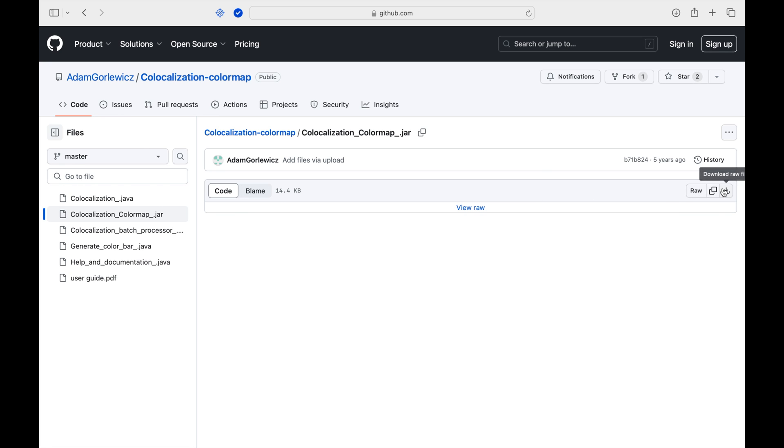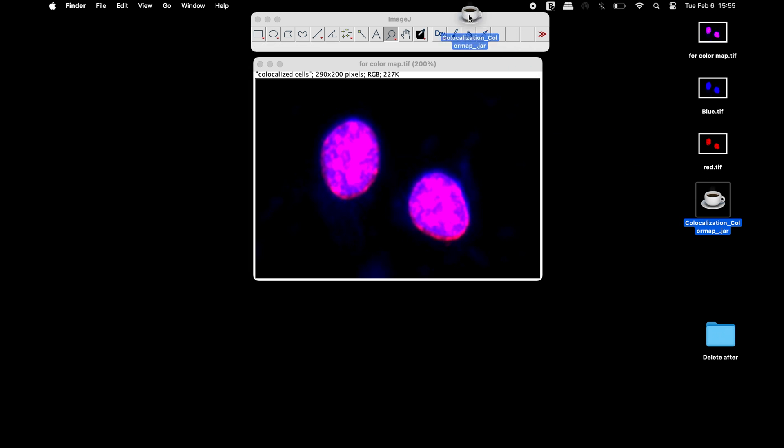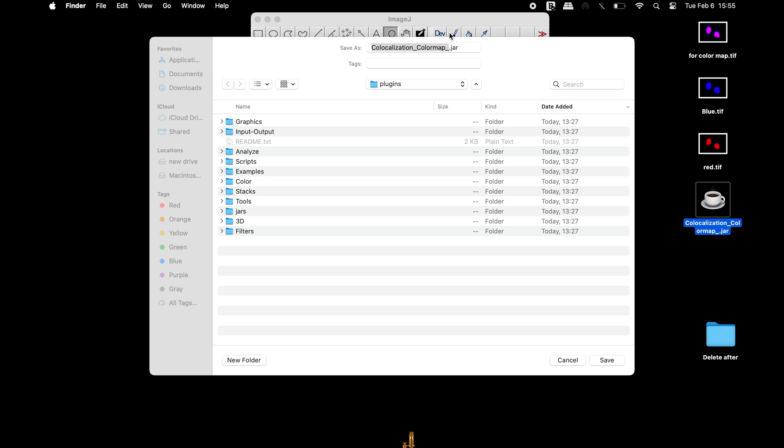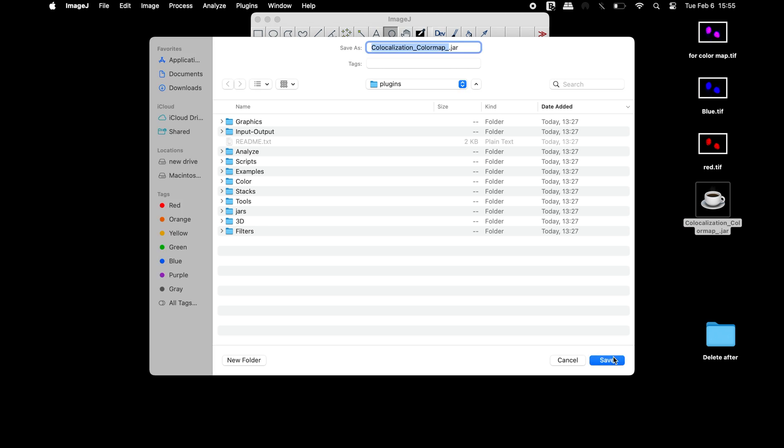Once the download is completed, install the plugin. A restart of ImageJ may be required to complete the plugin installation.